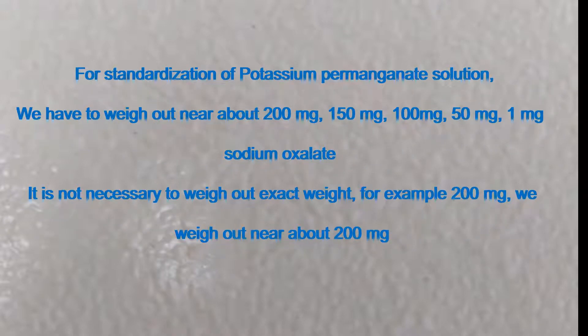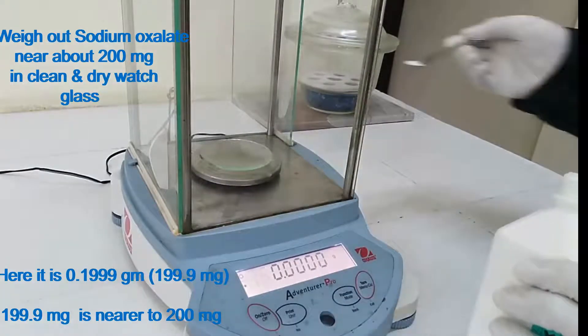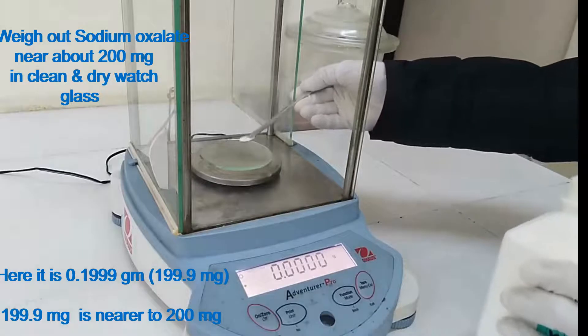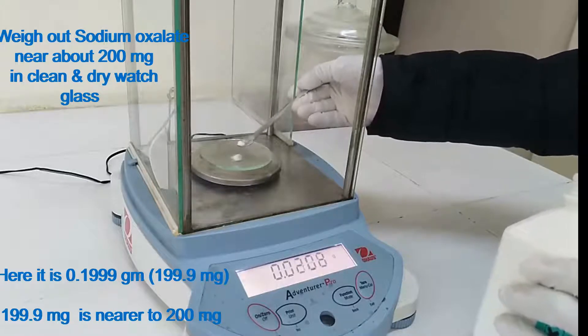For standardization of potassium permanganate solution, we have to weigh out near about 200 mg, 150 mg, 100 mg, 50 mg, and 1 mg sodium oxalate. It is not necessary to weigh out the exact weight. Weigh out sodium oxalate near about 200 mg in a clean and dry watch glass. Here it is 0.1999 g, that is 199.9 mg, which is nearer to 200 mg.